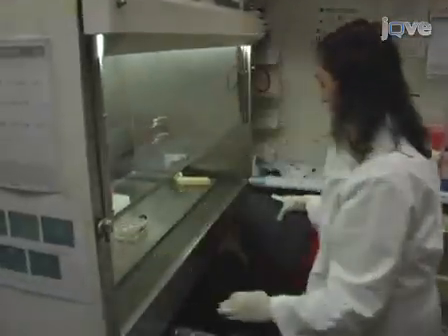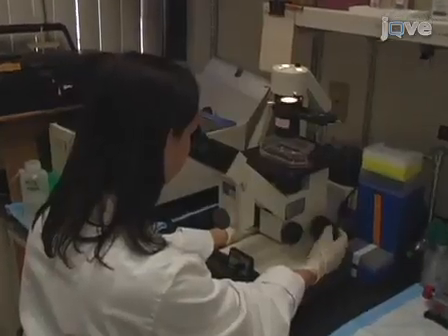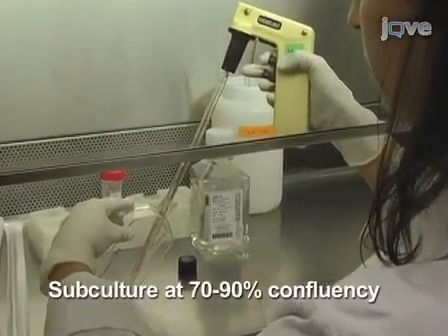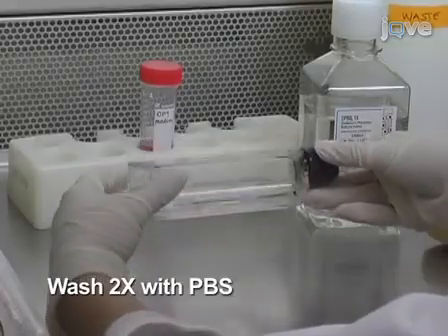M-strawberry OP9 cells are grown in OP9 cell culture medium, which must be changed every 2 days. The OP9 cells should be subcultured 3 days prior to when they are needed for co-culturing. It is important to note that during maintenance, the OP9 cells should never be maintained at a density above 90% confluency. First wash the cells 2 times with PBS.